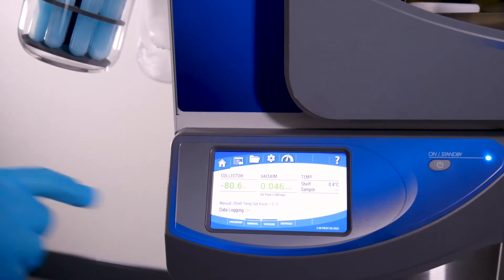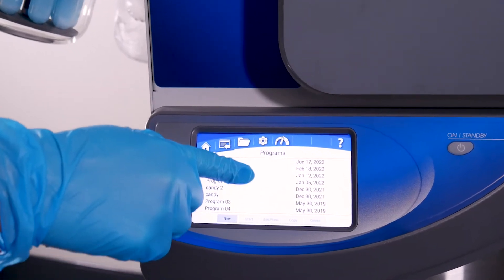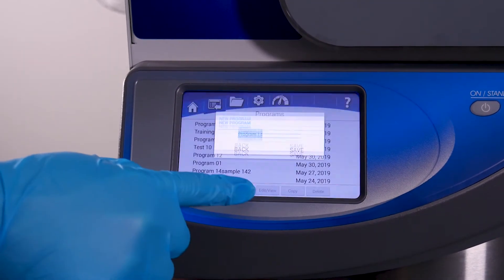The operating system is intuitive and user-friendly, with a 5-inch touchscreen that provides a color-coded display of collector temperature and vacuum levels, as well as onboard data logging.